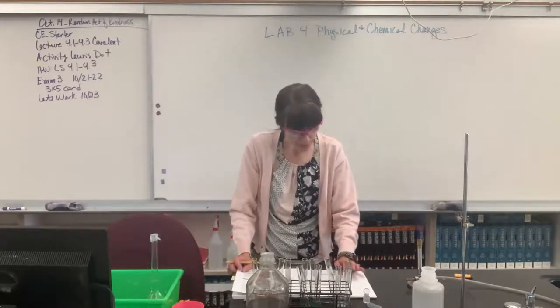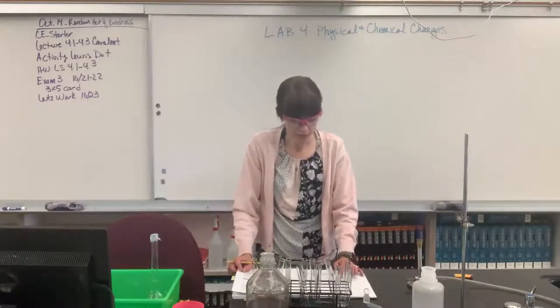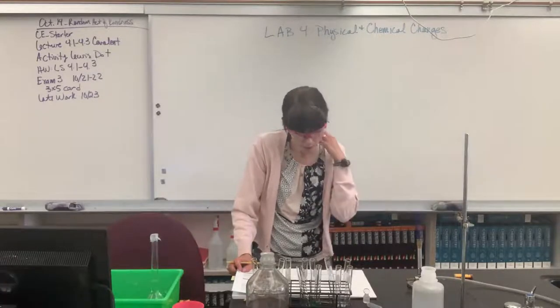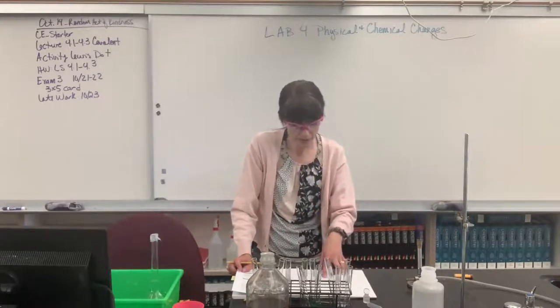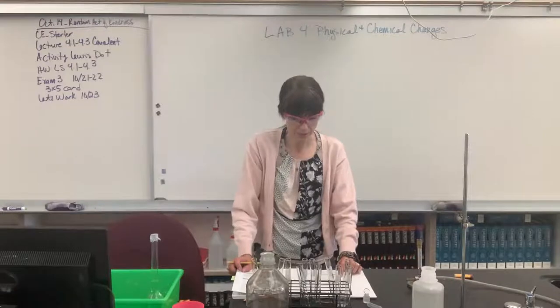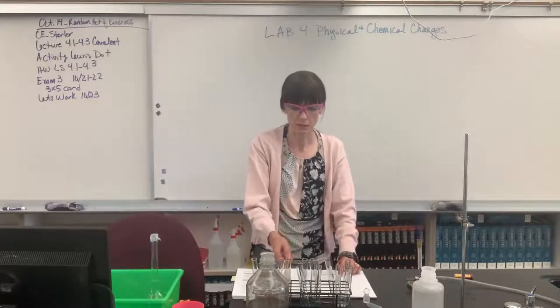We did number 7. Now let's do number 8. It says allow the melted sample to cool for 5 minutes. Great. The sample might remain in the liquid form even when cool. You have now changed the sample by melting it and letting it cool. So they want us to, number 9, add 30 drops of distilled water to the cool sample. So we're going to have to wait on that.